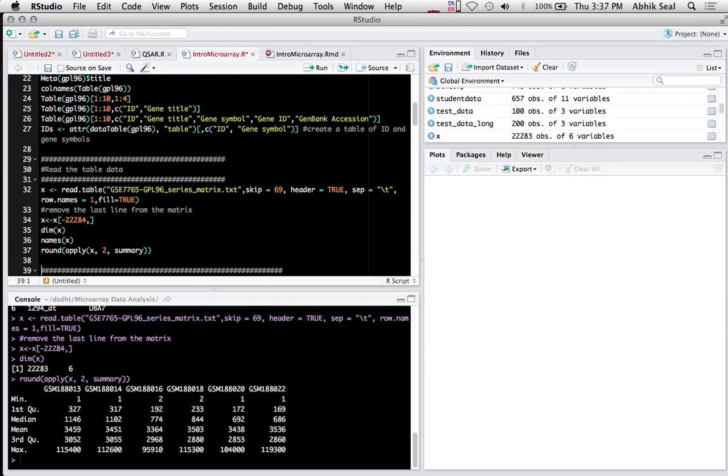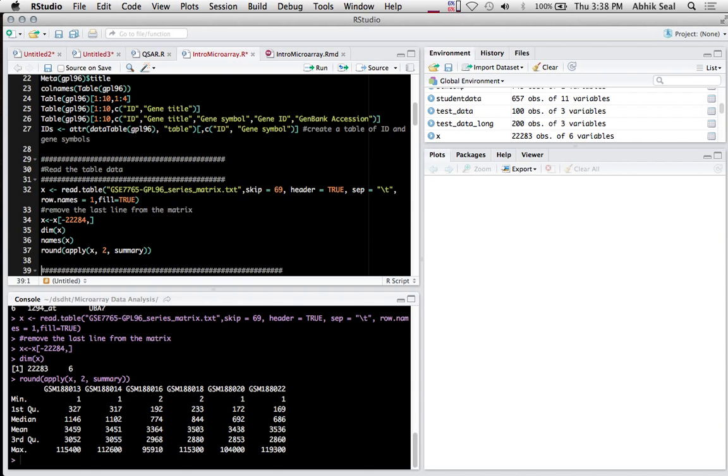The apply command gives you summary statistics of the different samples. Samples 13, 16, and 20 are the control sets, and 14, 18, and 22 are the dioxin-treated sets.